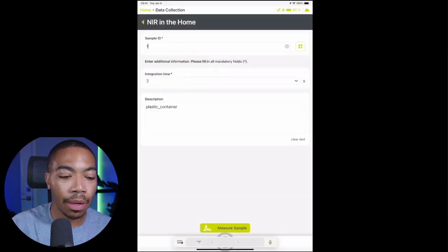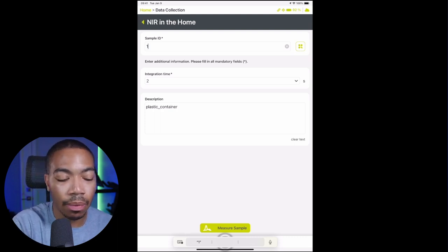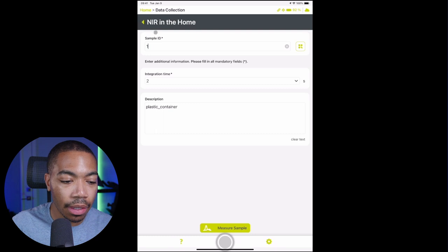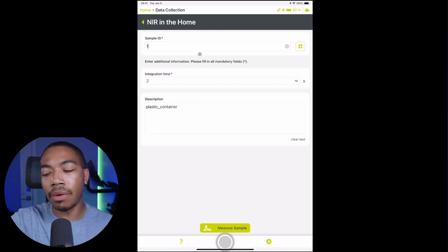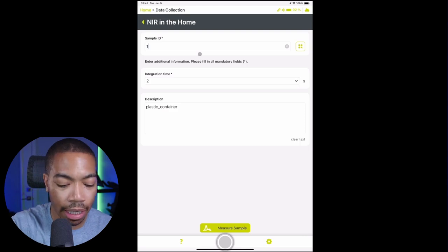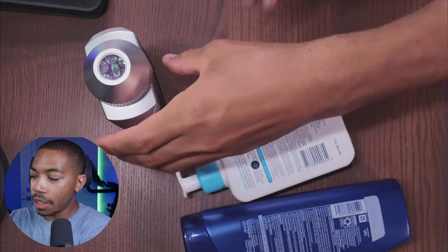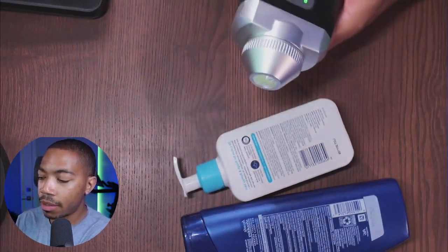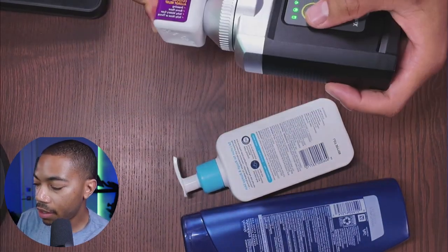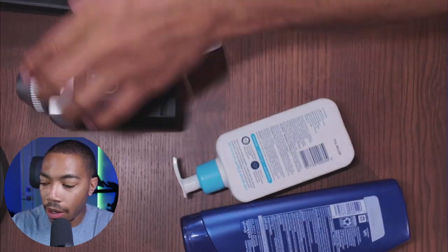And on the experiment side, we're just going to put in sample ID 1. And that's all we're going to need to link this sample ID 1 here to the sample ID 1 that can be found in that table I've just shown you. And now I will collect that data. So go to measure sample, and I will just collect a few replicates around the white sides of this material. And so that's 3 measurements on this material, and they all look pretty good.